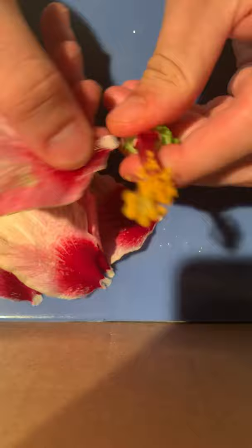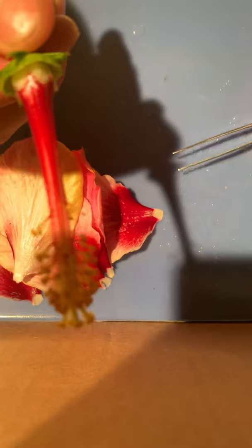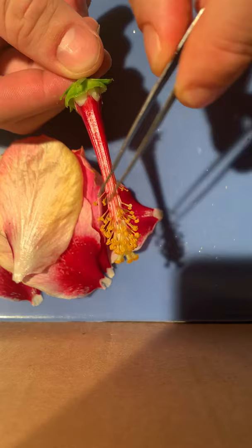Now we have a closer look at the reproductive structures. These little areas around the outside that are sticking up — this is the stamen, which is the male reproductive part.